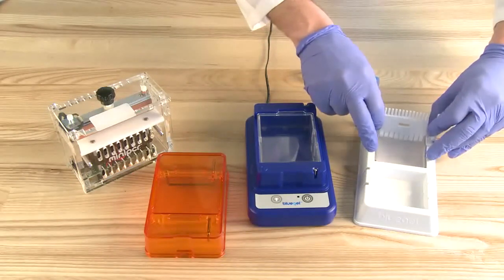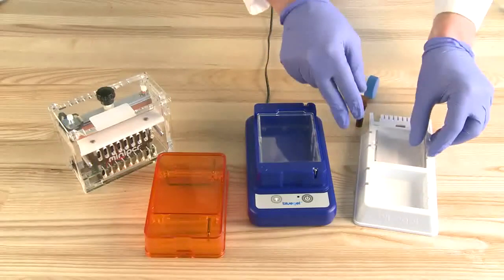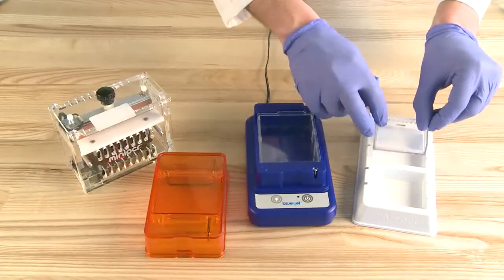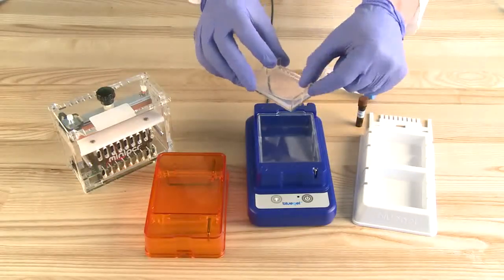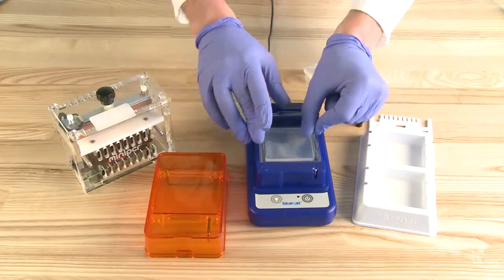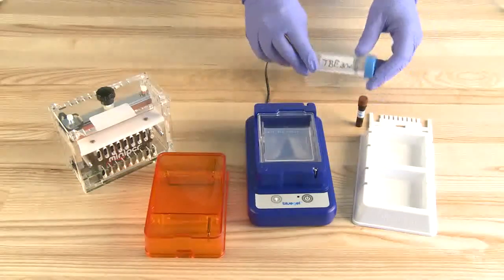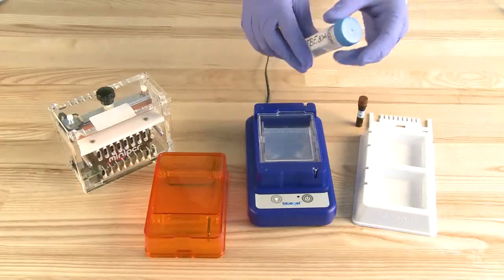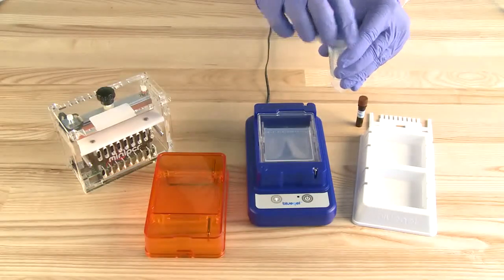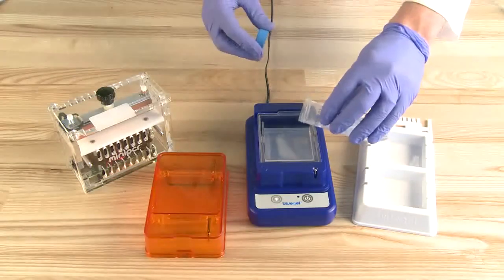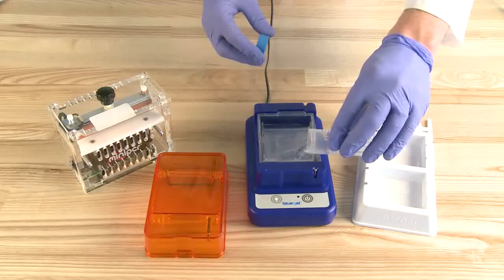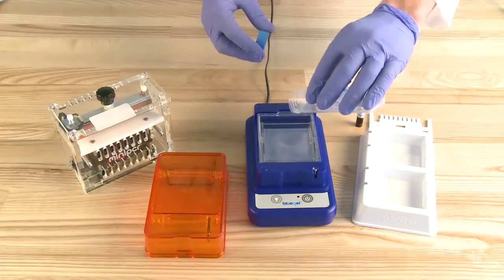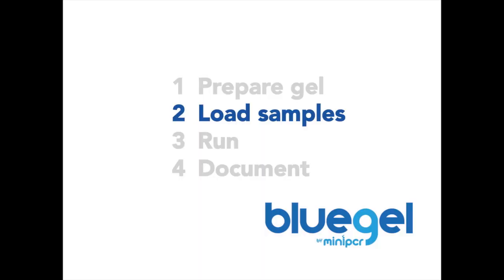Ensure the clear buffer chamber is placed in the blue base. Now transfer the gel tray to the buffer chamber. Make sure the notches on the outside of the gel tray align with the ones in the buffer chamber. Add 30 milliliters of running buffer into the buffer chamber. The gel should be completely submerged in buffer. Do not add more than 30 milliliters of buffer as it may overflow.